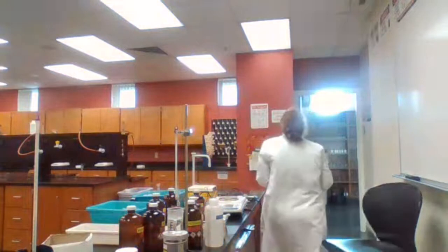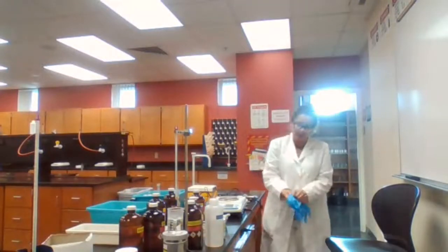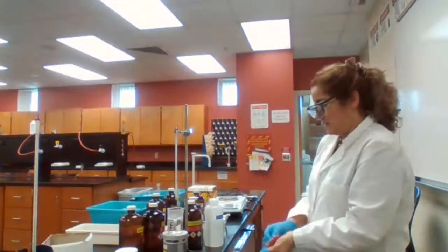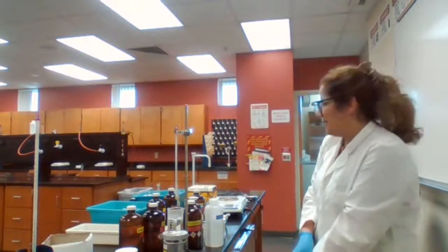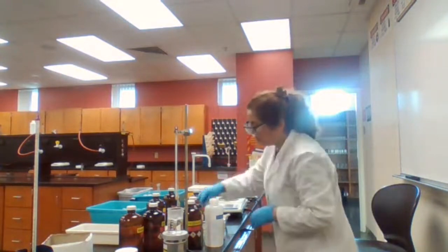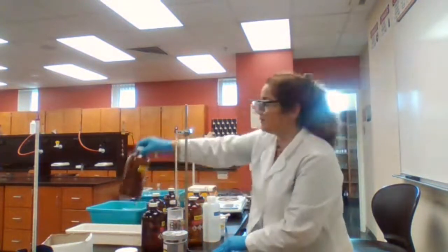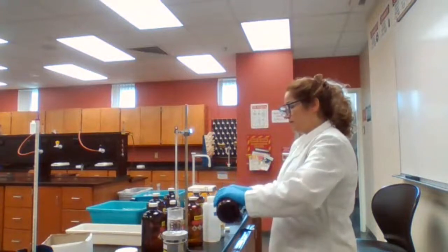Second mixture is sodium sulfate in methylene chloride. With methylene chloride, we cannot joke with some of those chemicals. I cannot touch it. I have to make sure I'm going to use my gloves for that. The first one was water, so I guess nobody is afraid of it. You should assume all chemicals are dangerous, they are corrosive, not good to use unless you know otherwise. So next is going to be methylene chloride and sodium sulfate. Methylene chloride is an organic solvent. What do you expect? Do you think sodium sulfate would dissolve in methylene chloride or not?